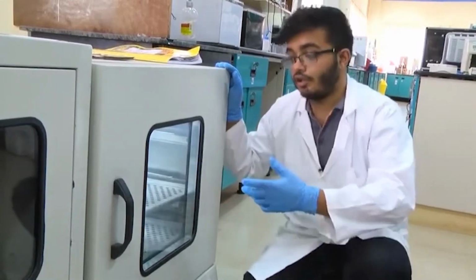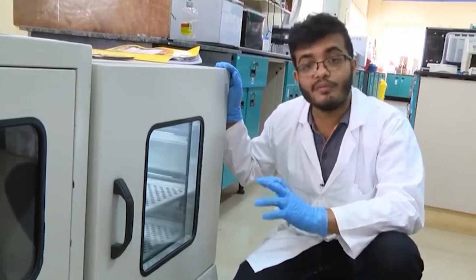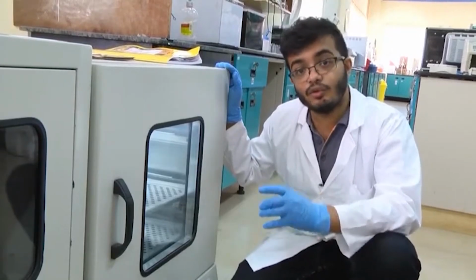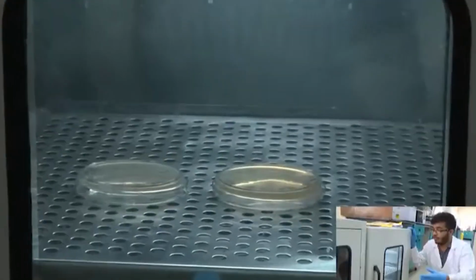In case we do not have any colonies, that is a problem, that means our experiment failed, and there could be many reasons for that. One reason is maybe the bacterial cells that we used were not competent, or they lost their competence because of storage.